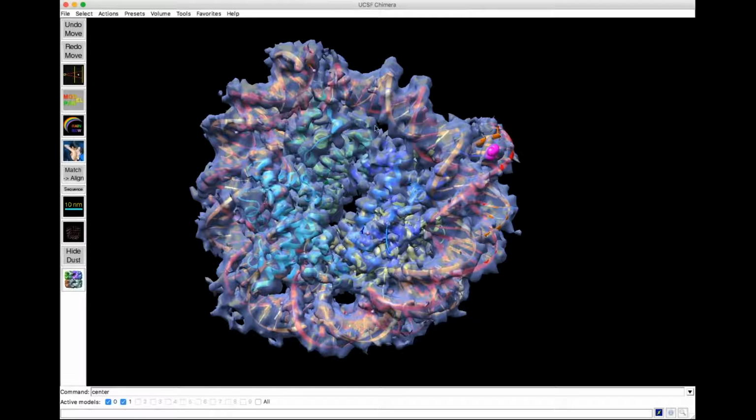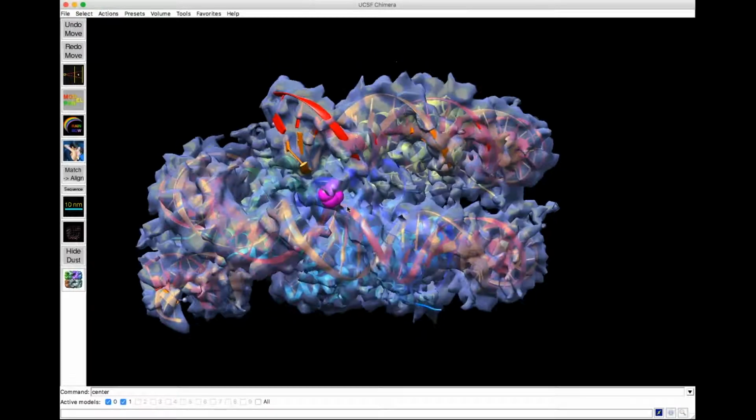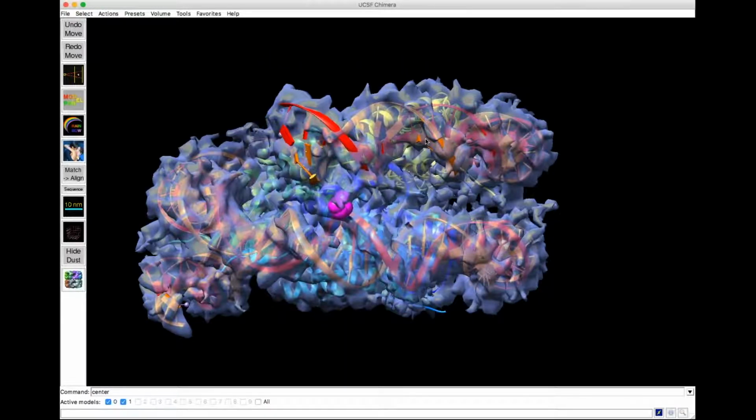Yeah, and then just for fun, I had us take an image on its side, where we see the whole structure in the background. You can do that by going File and Save Image. And in here, one of the things that I really like is doing this transparent background, because that just makes it nice and easy to pop into PowerPoint or whatever. So you can save that.